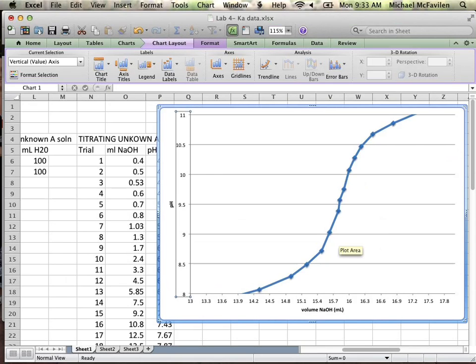So, since this is your data, you guys get to decide. Where do you want to call the equivalence point? Here, and I'll start a little marker here so you can see me move along it. Okay, I will start at the very bottom and slowly move upward, and you can tell me when we've reached it.